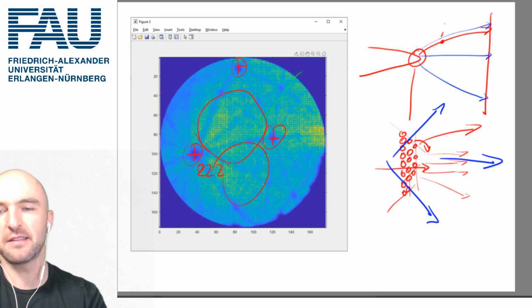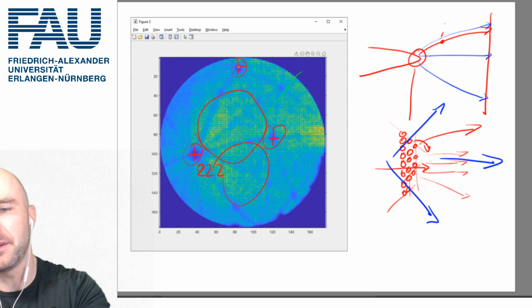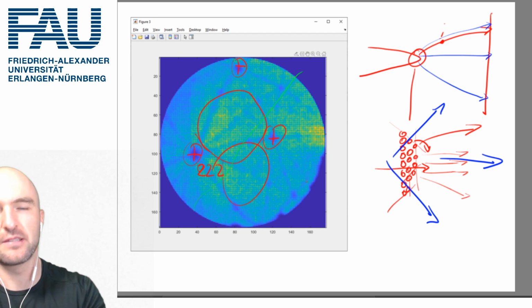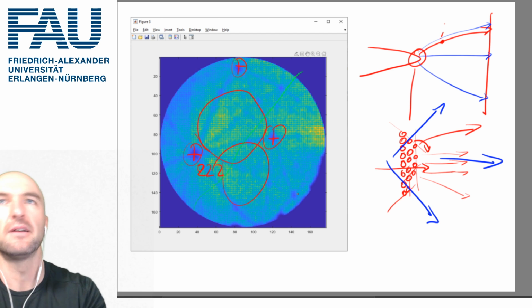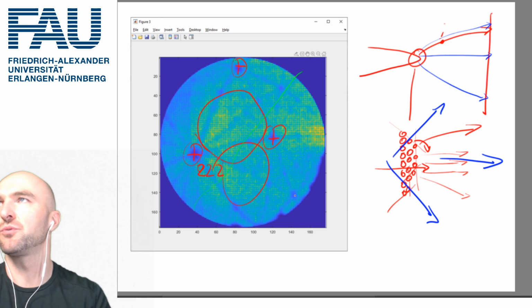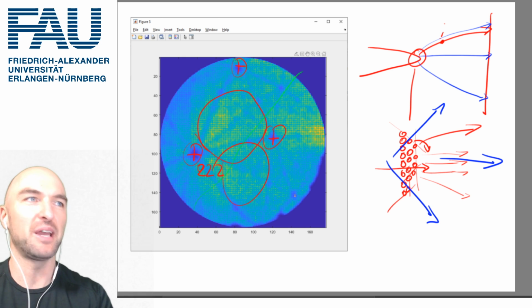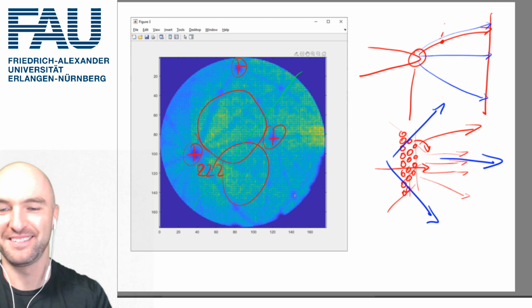Also, in this case, it's interesting for another reason, because this is made on a machine with a reflectron. And you can see, for example, that these lines should be relatively straight. But because it's a reflectron, it's not entirely straight, but Kamika uses software to take those distortions out. If I say something stupid in this case, Dave Reinhardt, you can stop me at any point.